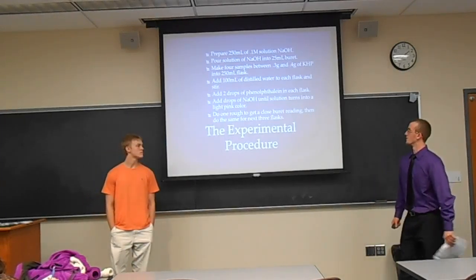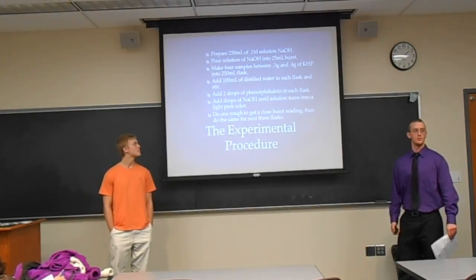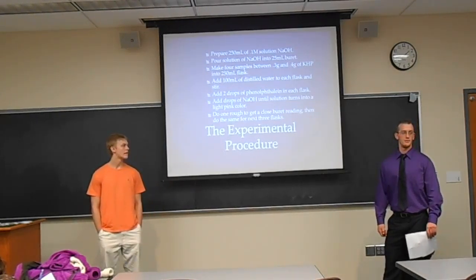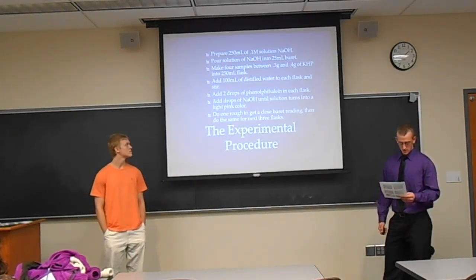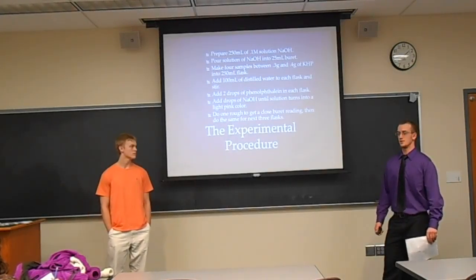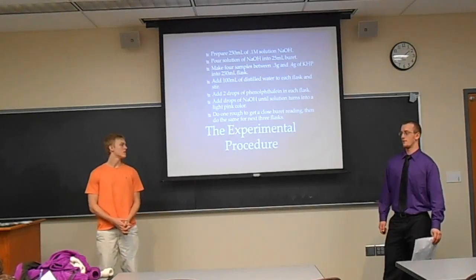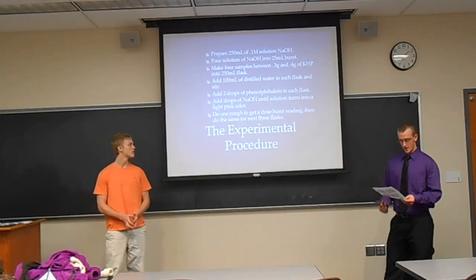100 milliliters of distilled water was also added to the flask with the KHP and was used to dissolve the KHP. Then 2 drops of phenolphthalein indicator were put in. These were used to show the reaction had occurred through a change of color. And the NaOH in the burette was dropped in until the solution changed to a pink color. That's when we knew that the reaction had occurred. First we did a rough trial, and then we did 3 others just to see if we could find like an average result.